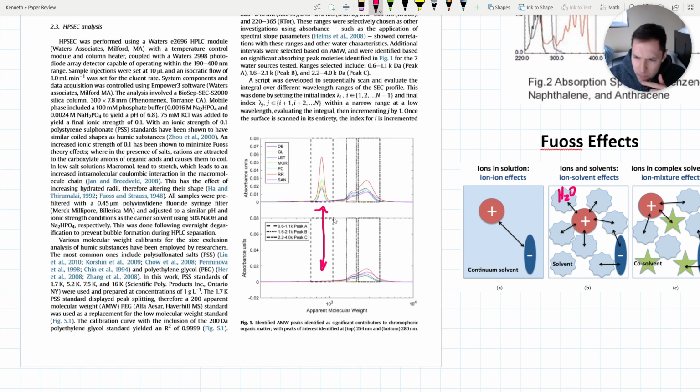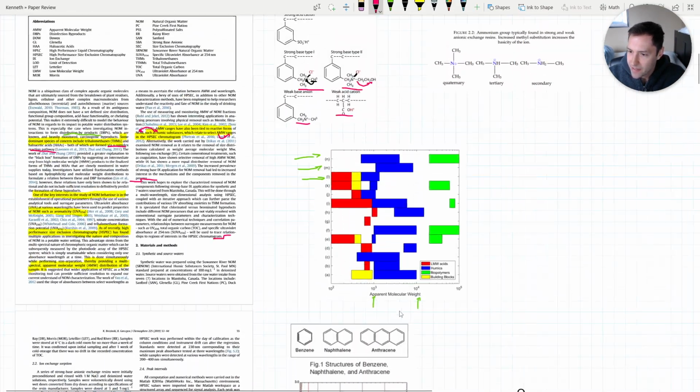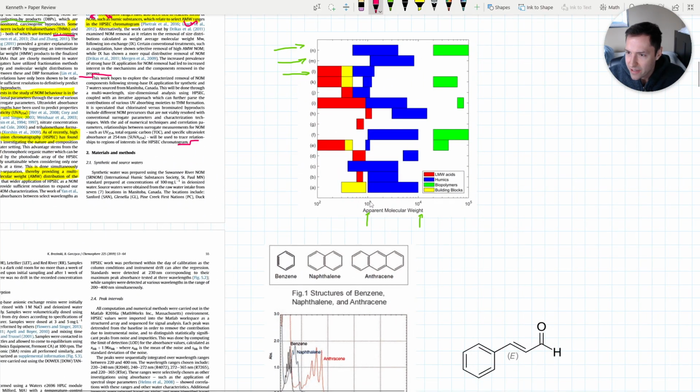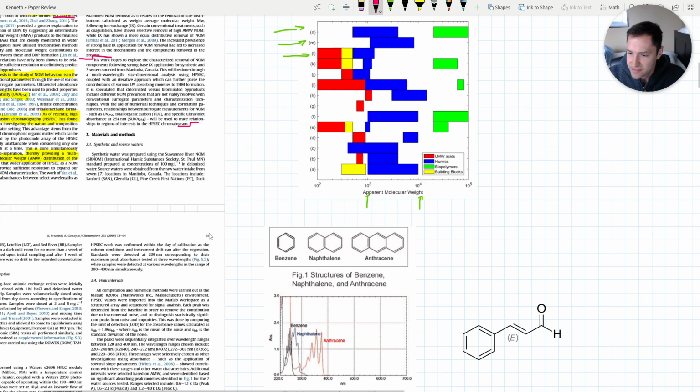Actually, no, I think this is the original. Let me see, actually, come to think of it, this is the original water sample. So this is just to demonstrate, now I remember, that when we're looking at these 7 different source waters, there's a lot of distribution when it comes to what compounds you're looking at. There are these huge peaks just south of 10 to the 3, so it could be in the 800, 750 apparent molecular weight. Going back up here, we can ask, what's around 730, 800? Well, we tend to see low molecular weight acids, right? And perhaps some humic substances.